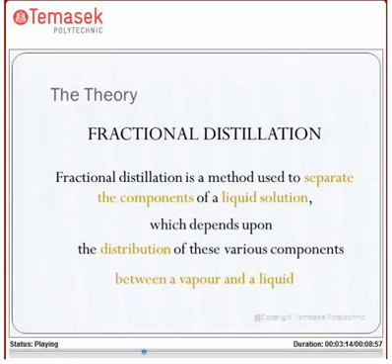Theory for fractional distillation. The main objective of fractional distillation is to separate the components of a liquid solution. Separation is possible as the components distribute themselves differently between the vapor phase and the liquid phase. You can consider that some components are more volatile than others and have a higher tendency to become a vapor.